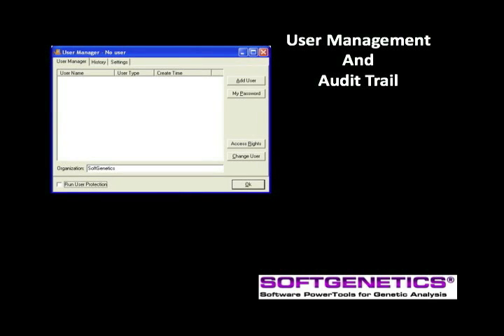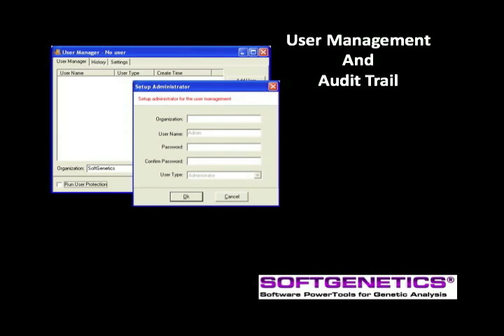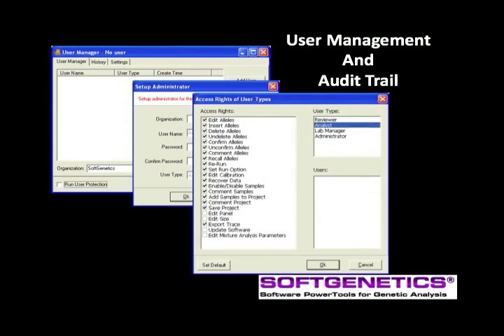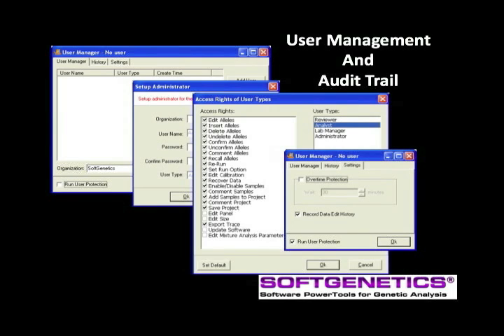To begin, let's activate user management by selecting Help and User Management from the upper drop-down options. User management provides control of user access rights and generates a user and edit history for each project. The administrator enters the institution name, password, and activates user management. Choose from a list of access rights for each authorized user. The operation history is recorded in the History tab. Settings include overtime protection and recording edit history of all actions, providing a complete audit trail.